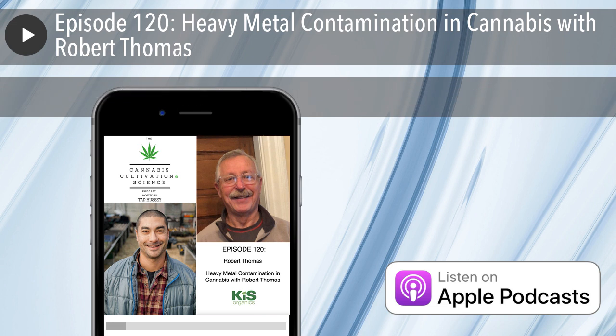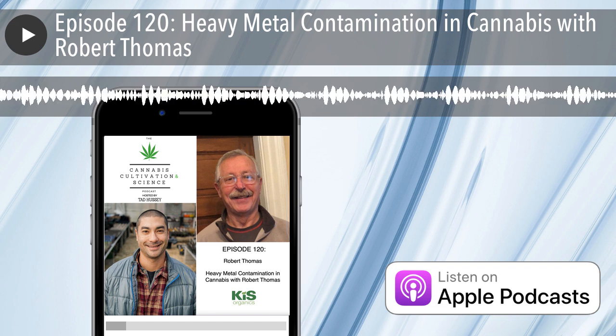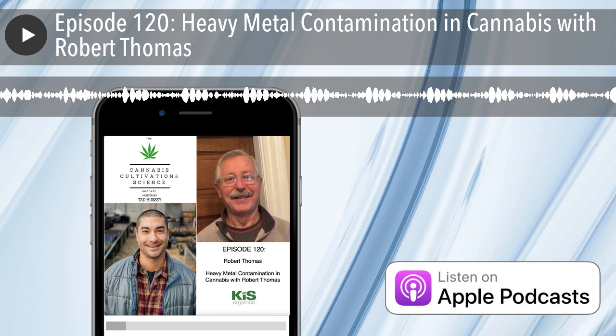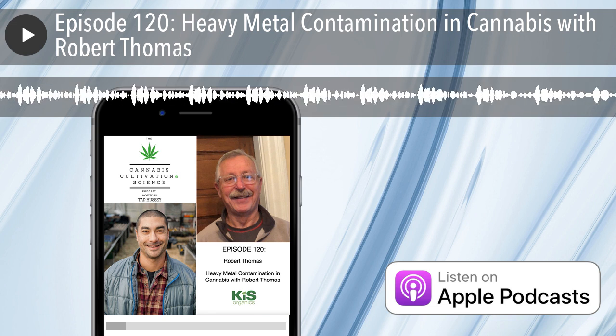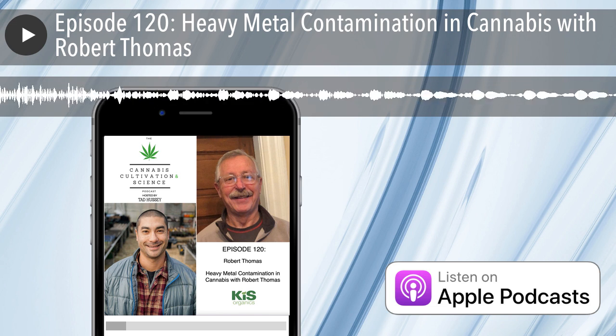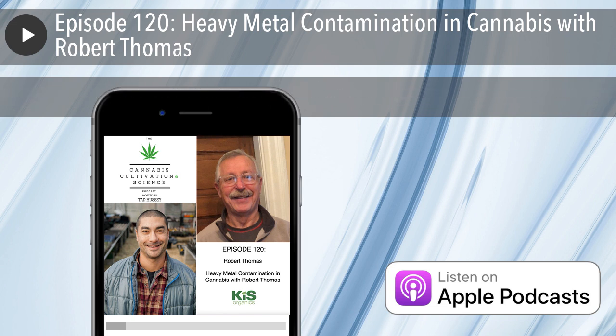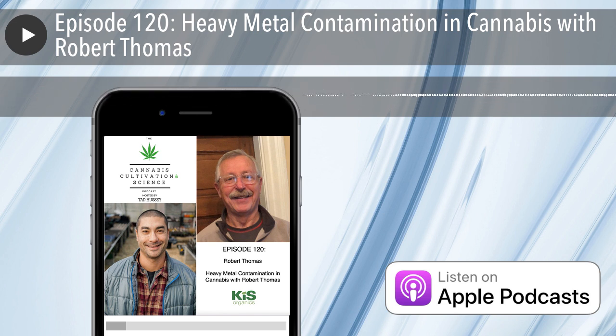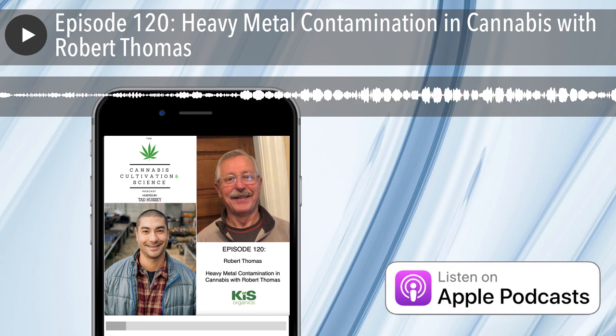And I think it's fair to say that it's not like a semiconductor lab, where the semiconductor industry is used to working in the ultratrace environment, so they know how to set up an ultratrace testing lab. I think state cannabis labs have not really had to do that, and I think some of them might be lacking. I'm not saying they're all lacking, but I think it's fair to say that some of the state labs have other priorities, and they might not be so diligent in making sure that the labs are doing a really good job.